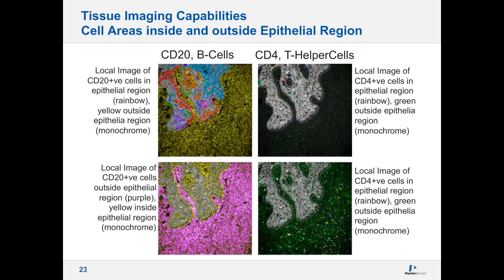It really keeps everything in context to the environment. The only way to do this before was to use flow cytometry, so they'd have to dissociate the tissue and then run it by flow cytometry. But then you lose everything in context. So now you can't measure where these particular phenotypes are in relationship to a tumor infiltration, for example.